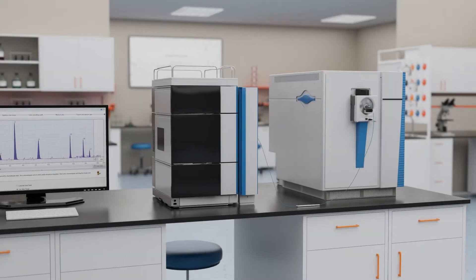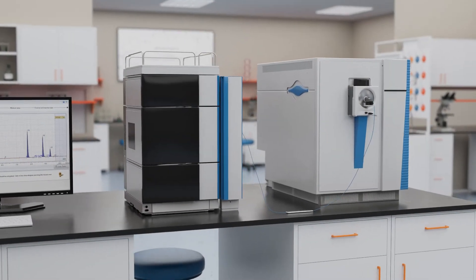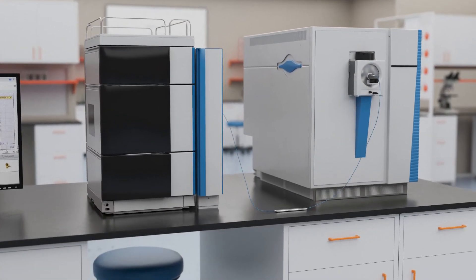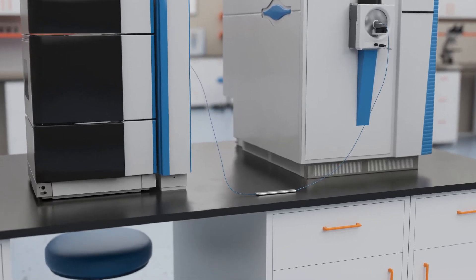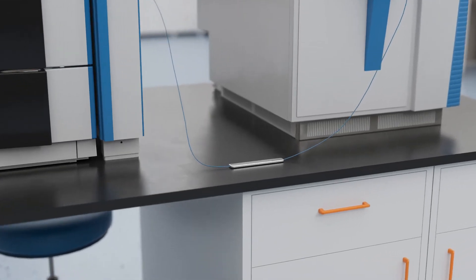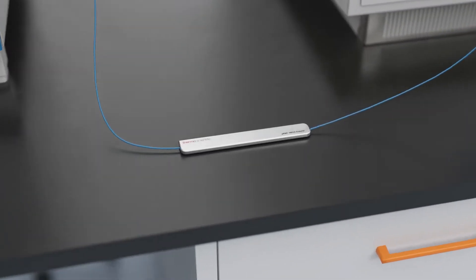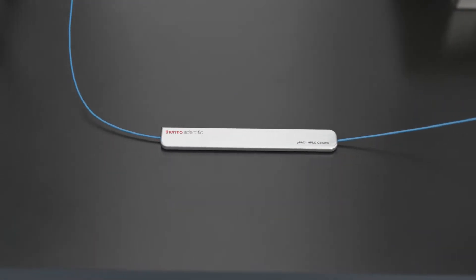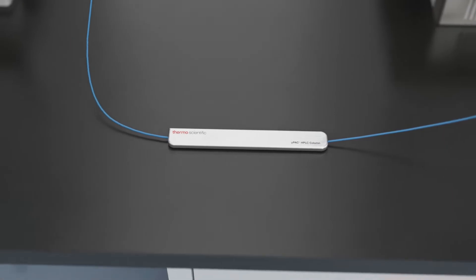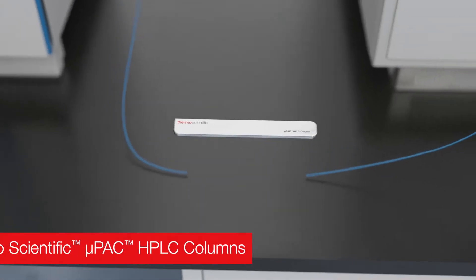Analyzing complex biological samples is a challenging process, especially when critically limited sample amounts demand low flow chromatography for sensitivity.